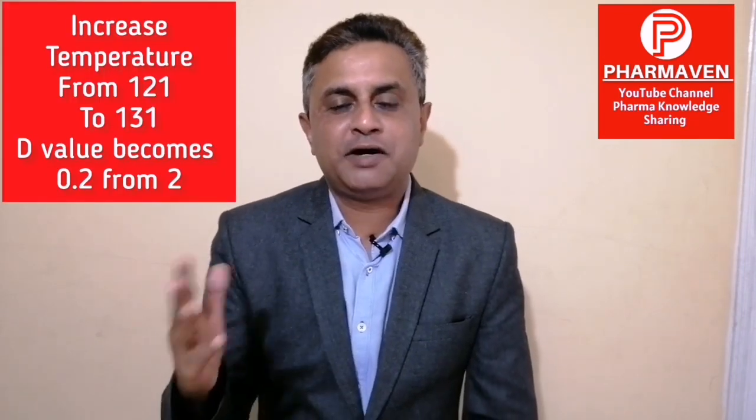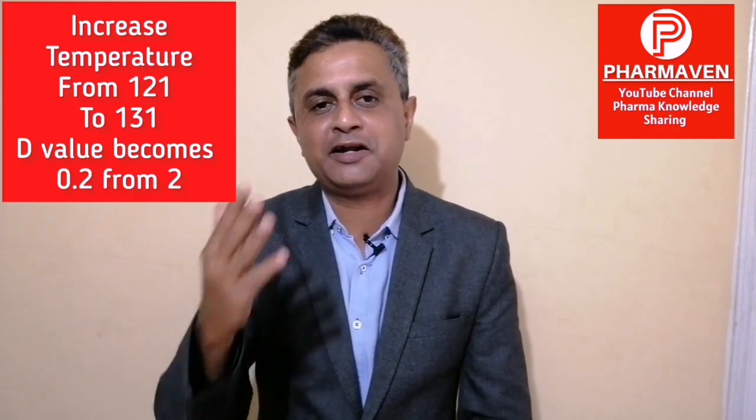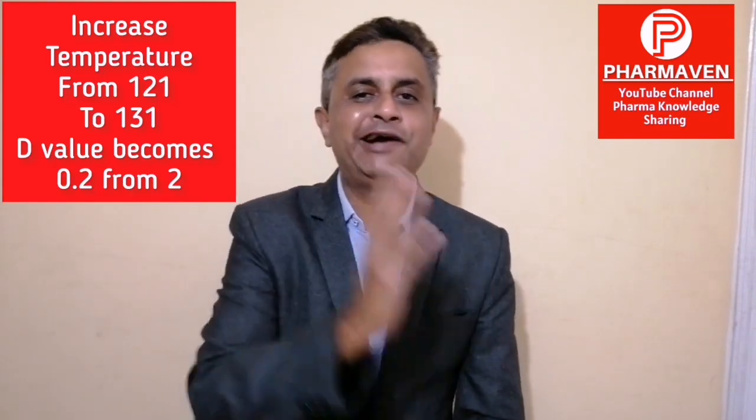Now let us understand Z value. Z value is the number of degrees of temperature change required to change the D value by a factor of 10. So for example, my D value of a microorganism at 121 degrees is 2. If I increase the temperature by 10 degrees, so if I make the temperature 131 degrees, then D value will change by a factor of 10. So it will become 0.2.